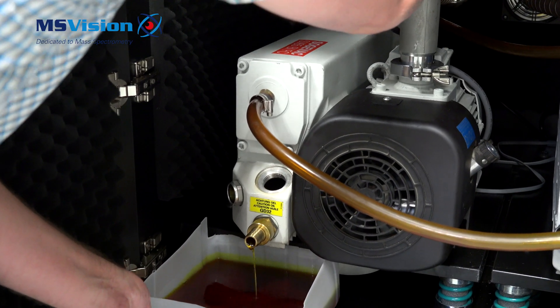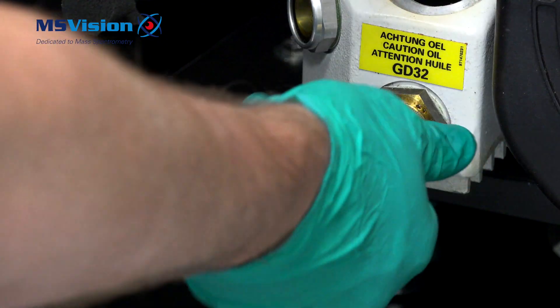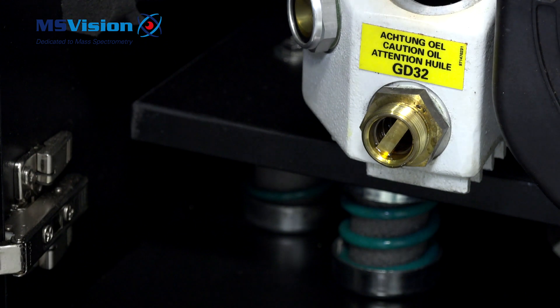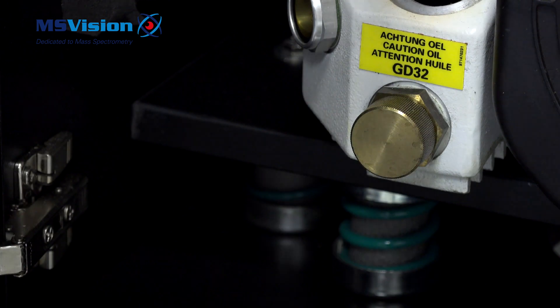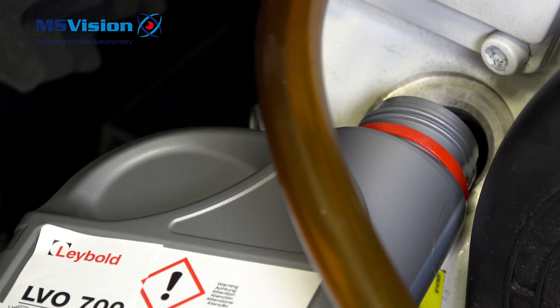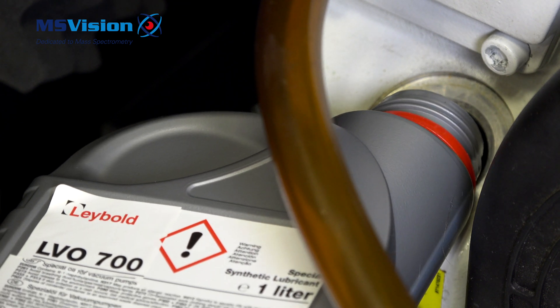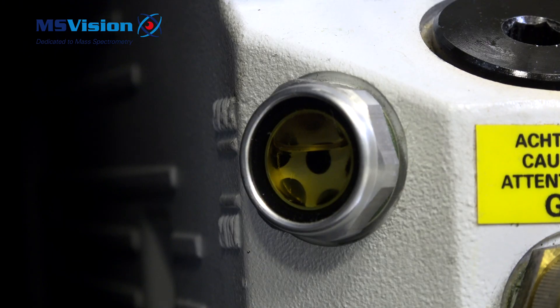To fill with fresh oil we need to remove the drain fitting. Have some tissues to hand to keep things clean. Put the cap back on and ensure it is tight. Fill up with the correct oil type — put one litre straight in, as it holds nearly two litres. The final correct oil level should be halfway up the glass viewing port.